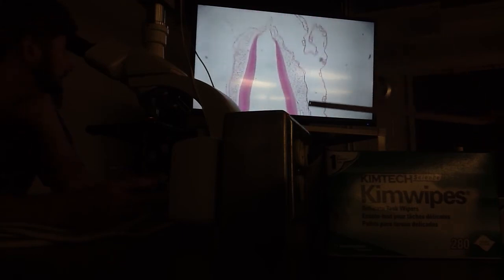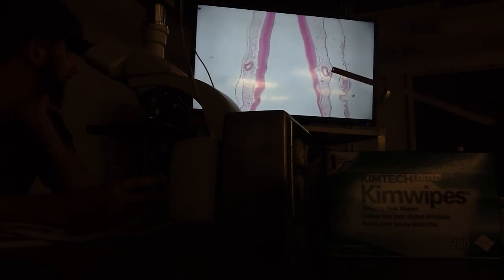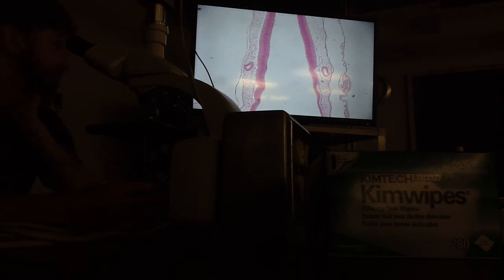This structure here. Let's do the other way. This structure here is vesicular near the ectoderm. In chicken embryos, you have 2 possibilities. One is this, but I don't see the appropriate relationship. And the other is this.